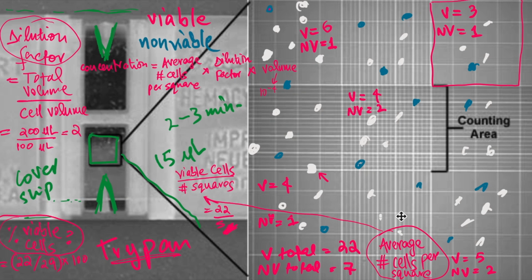It could be different depending on different standards. However, concentration is calculated in, because dilution factor would not have any units. If you look at its formula, the microliter gets cancelled with microliter.